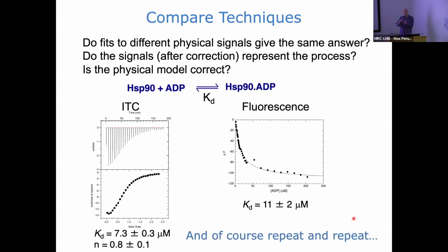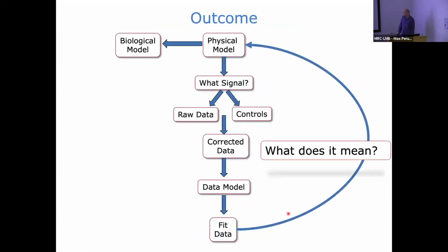Obviously good, if you've got binding from different techniques, compare, say, in this case, comparing ITC against fluorescence, and of course, repeat. And then hopefully you've got something that will be meaningful.